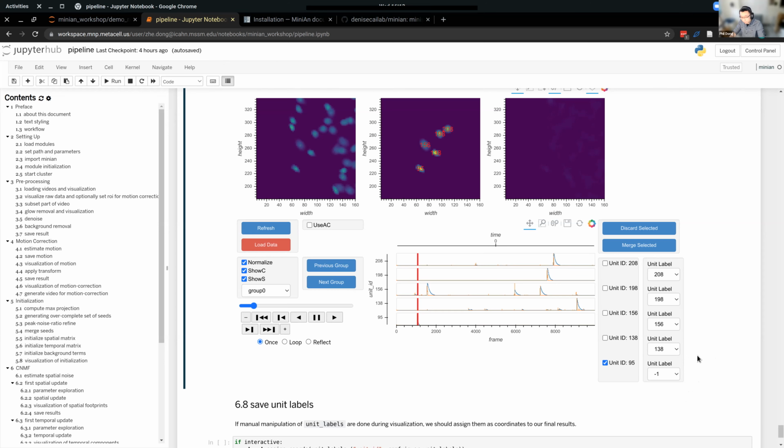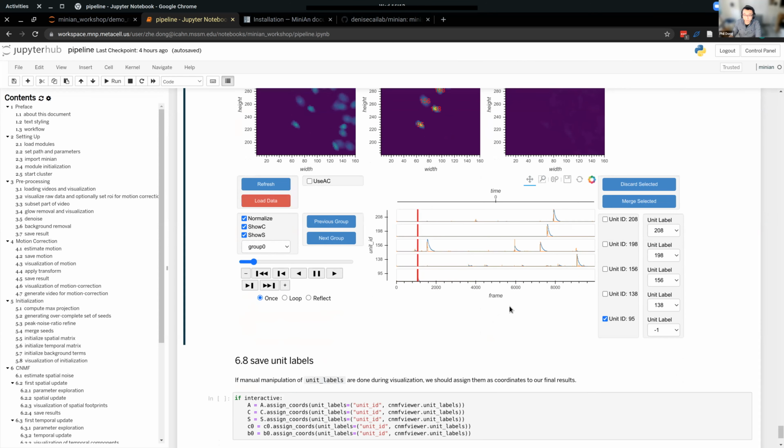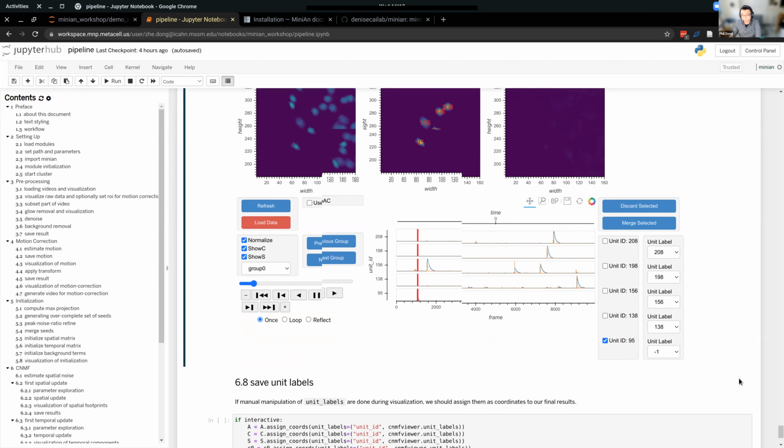Because what happens if you go back and change your mind and say, maybe I'm dropping too much? Things like that may happen in practice. So this is our way to store this information without dropping stuff for you.